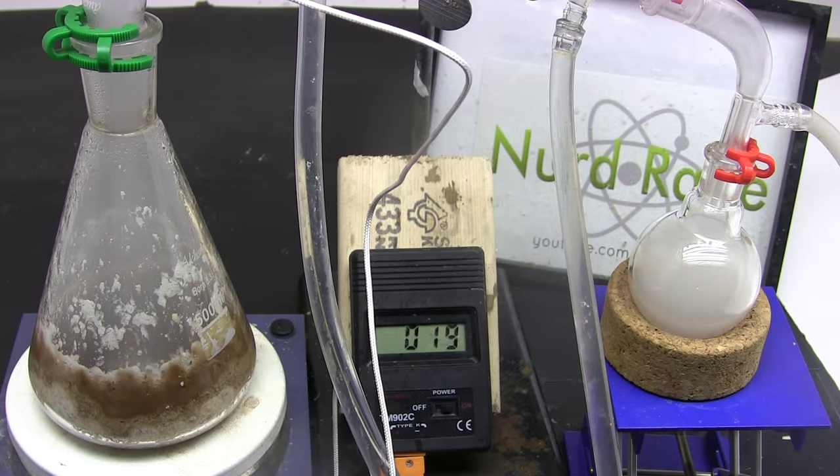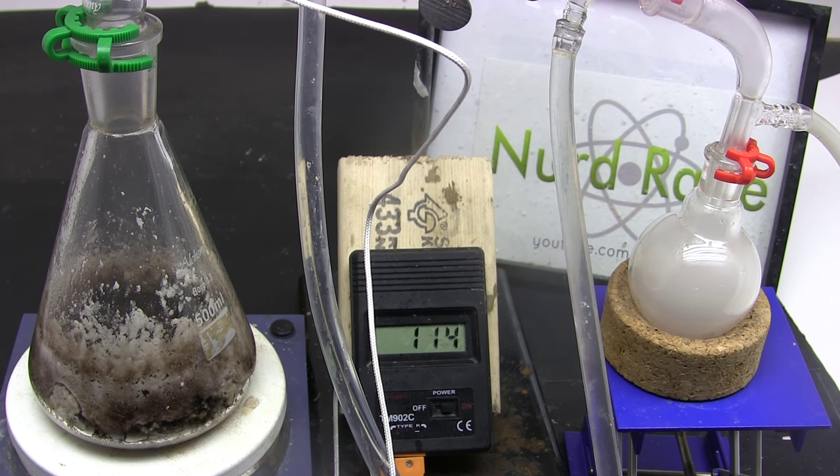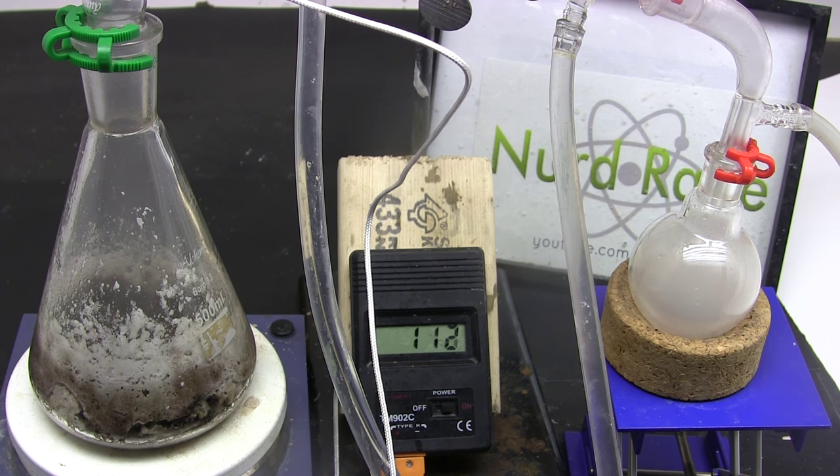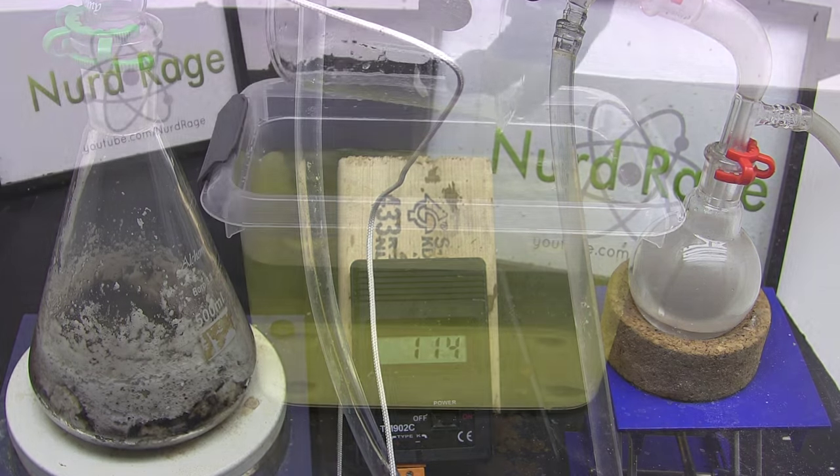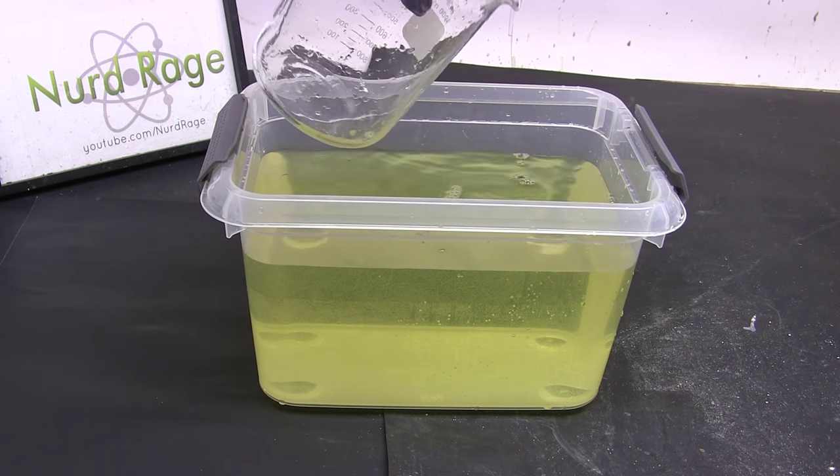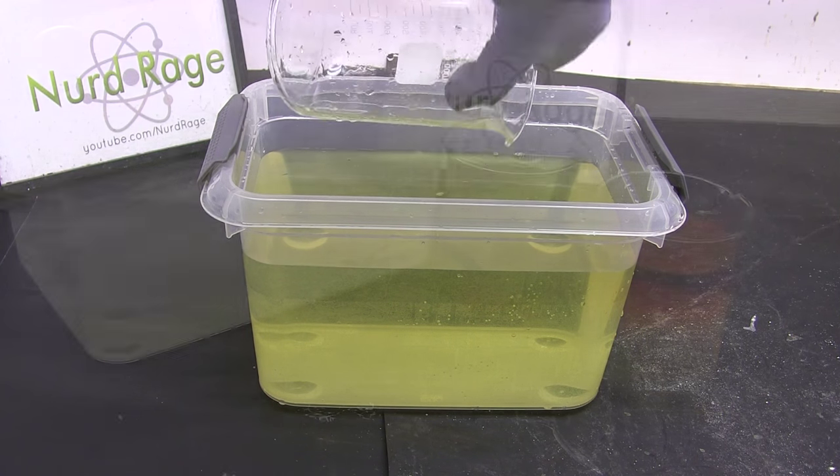Now distill off the propionic acid. I'm not using a vacuum but it looks like we're not reaching the boiling point of propionic acid at around 141 degrees celsius. There might still be some lingering impurities like water and organics. You're probably wondering why we didn't just dry the original sodium propionate solution and add sulfuric acid to that to distill out the propionic acid.